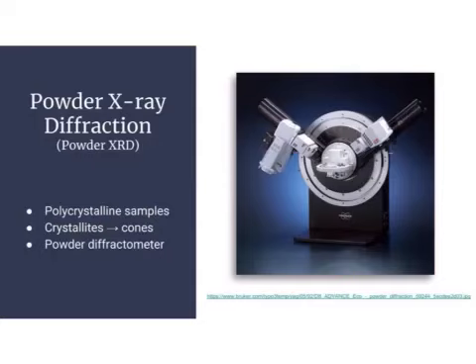If you're paying attention in the outline, there was a photo of circle-esque things. Now, as we've been discussing, as these beams come in, they reflect off of our sample, and they give us an output. That output, if you look at it as a whole, comes out in the form of a cone.